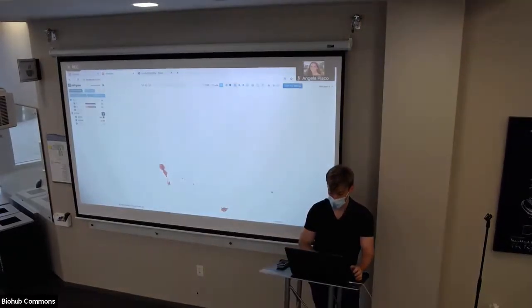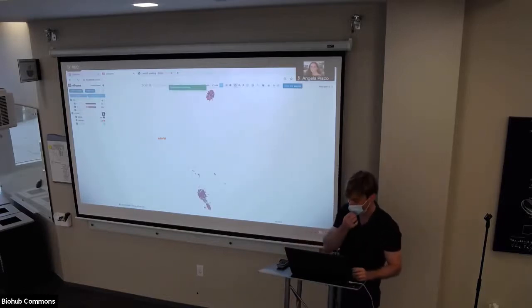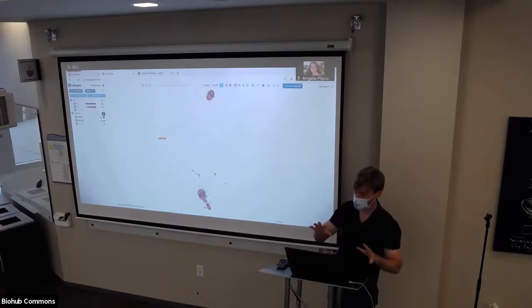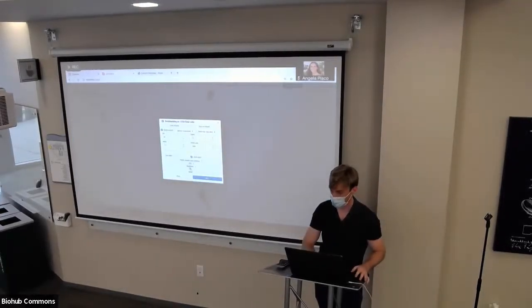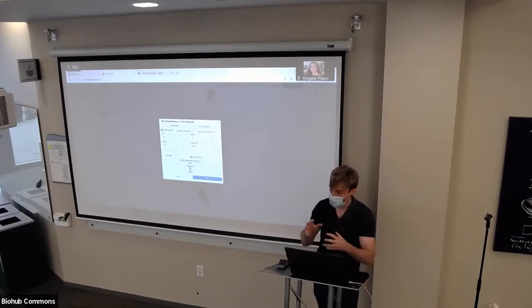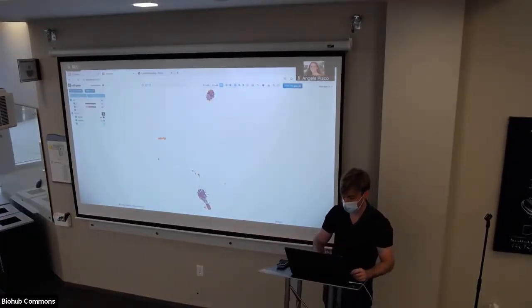It automatically subsets to this data. And then it's going to generate a new view of your data. So what is the difference between subsetting and subclustering? Subsetting is just removing all other points in the scatter plot that aren't part of that set. Subclustering is actually running through each step of this analysis workflow from the data. And the reason this is so powerful is because in doing this, PCA can now focus on variability between these cells, not cells in the full data set.